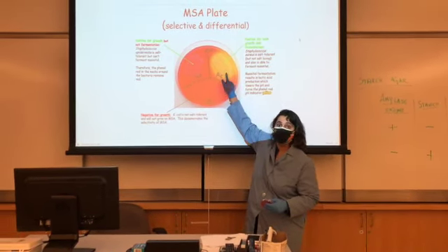E. coli is not a bacteria that is found on your skin. Typically it is an intestinal bacteria, gut bacteria. So that's the reason you can clearly see that there is no growth wherever the E. coli was swabbed. So how do you do this? You take the E. coli and use the sterile swabs.